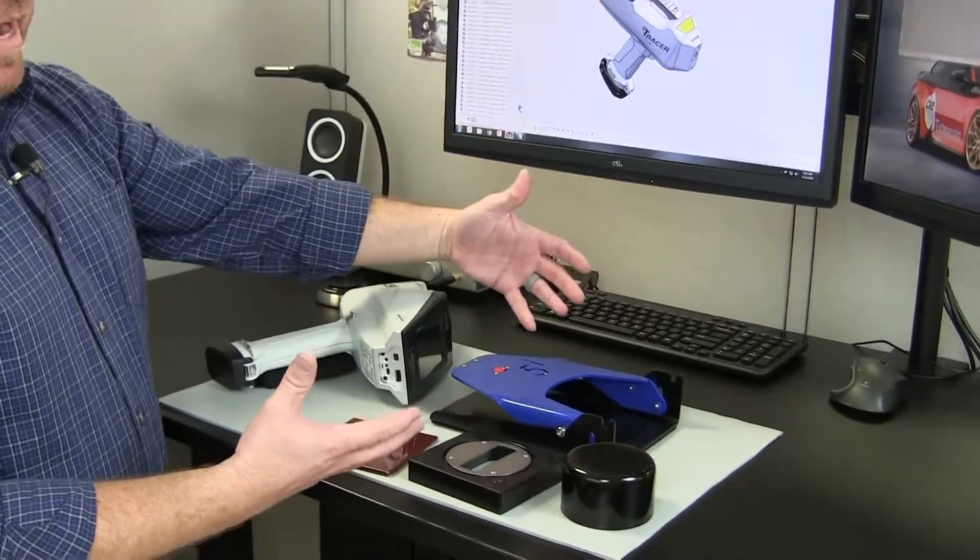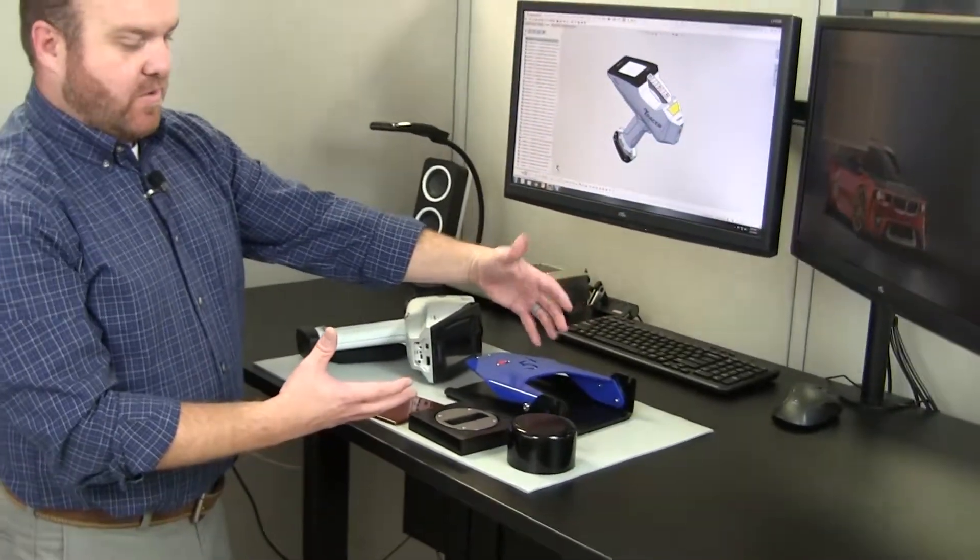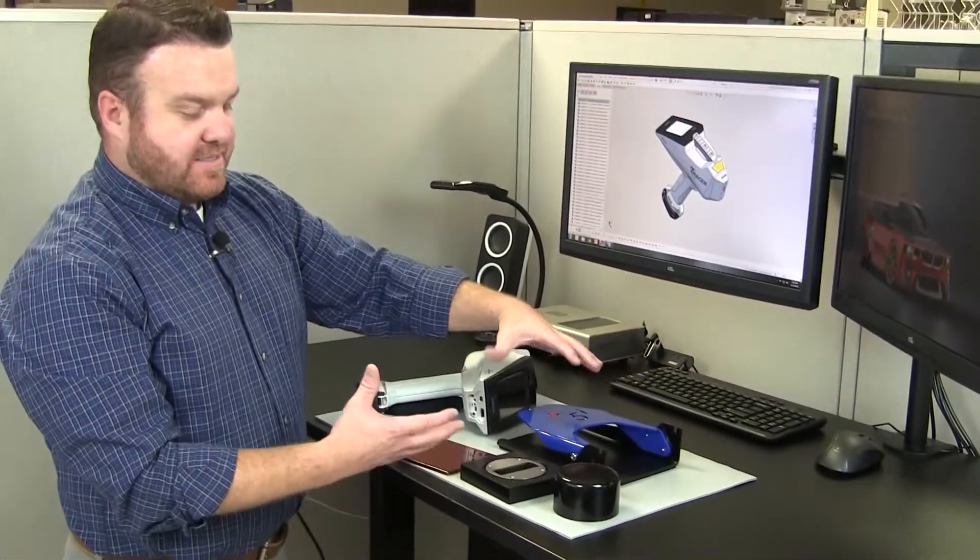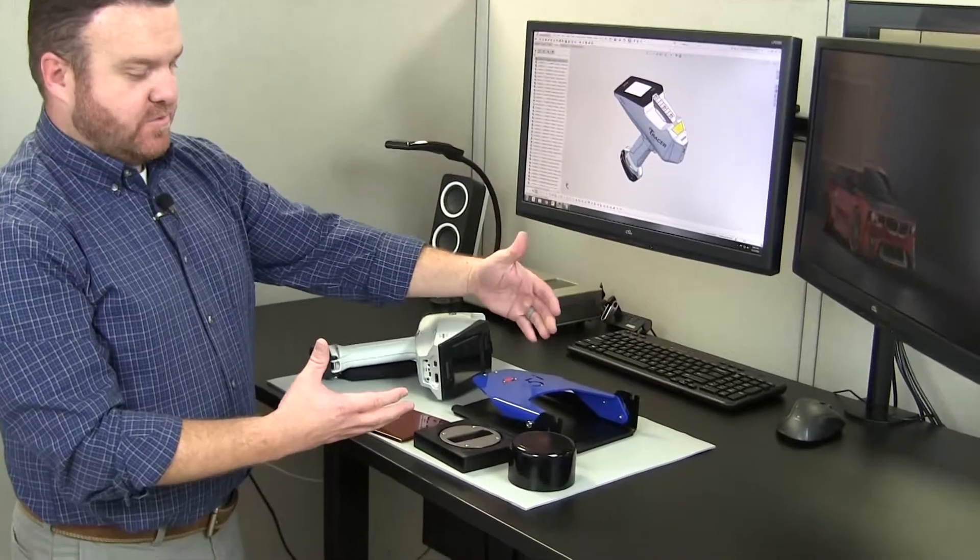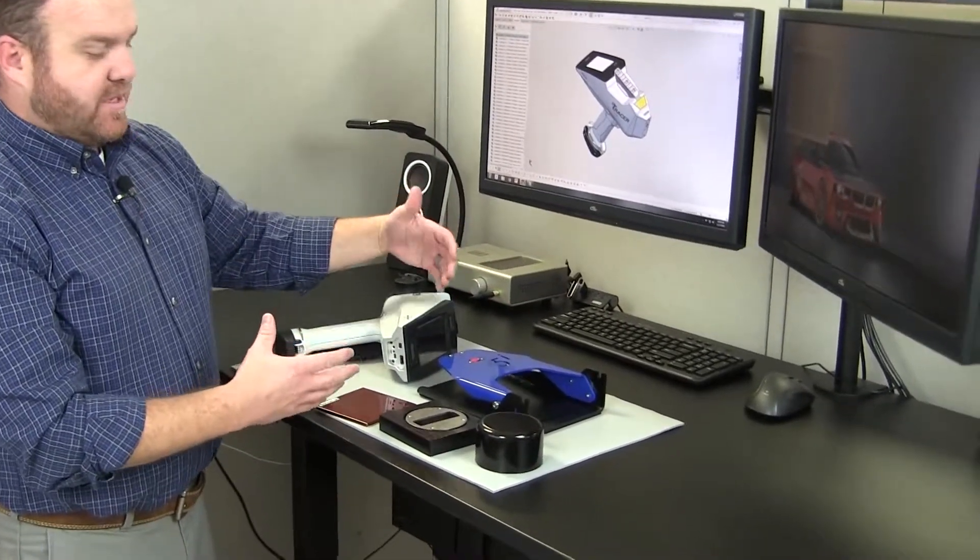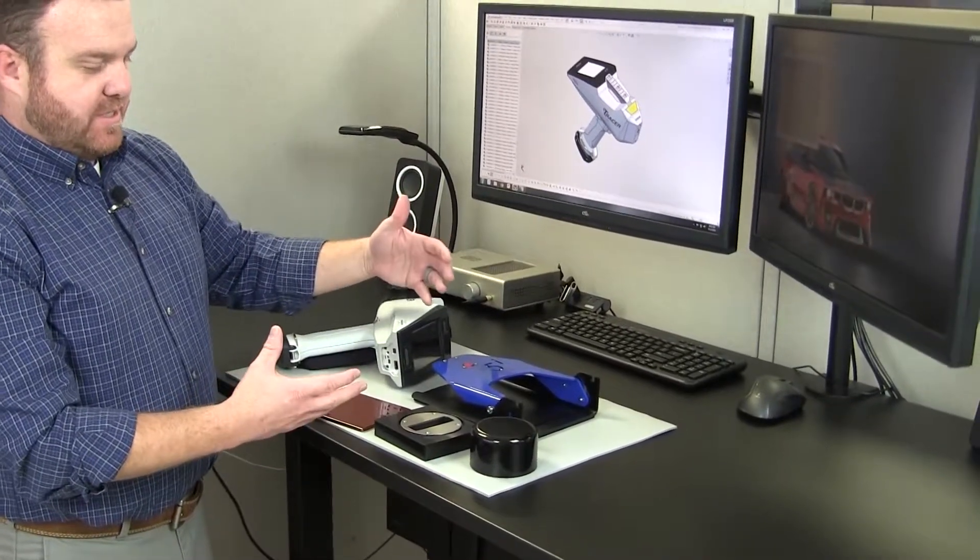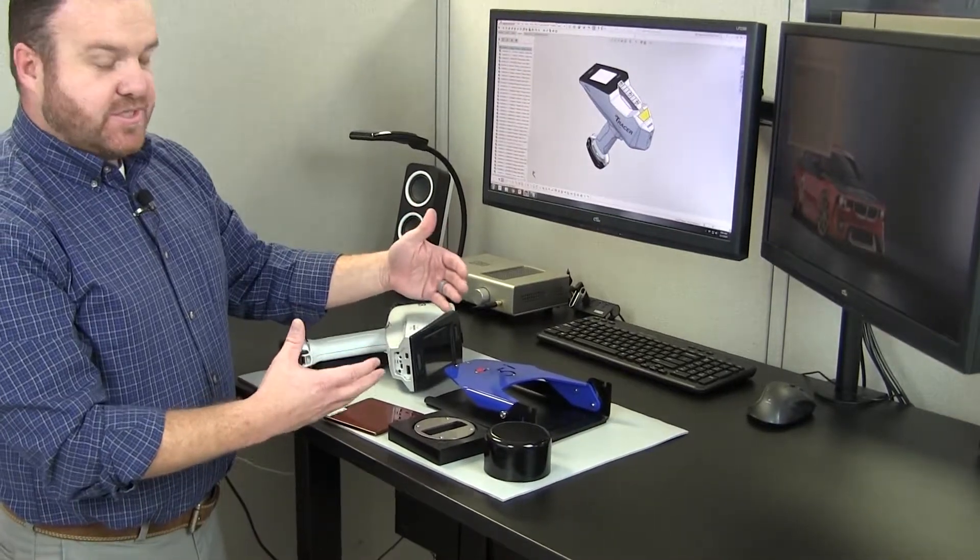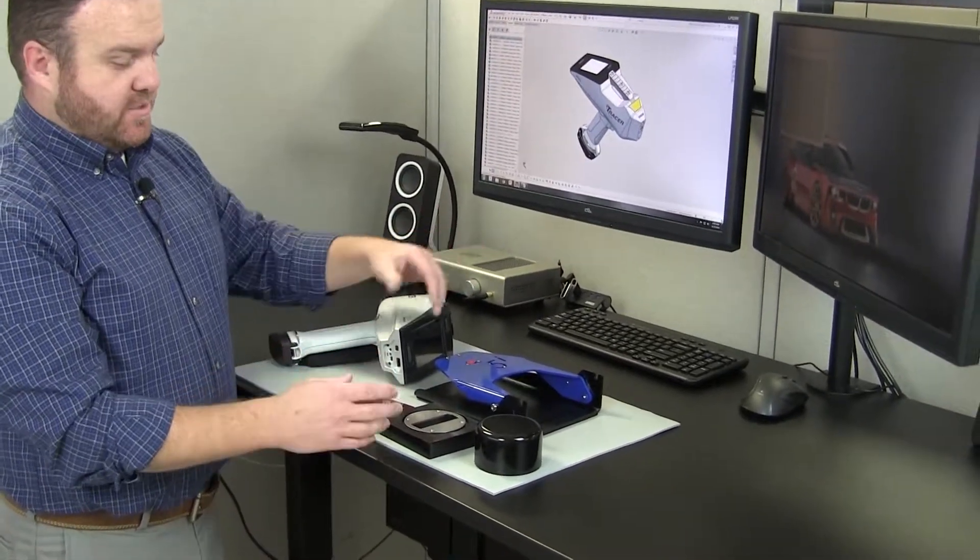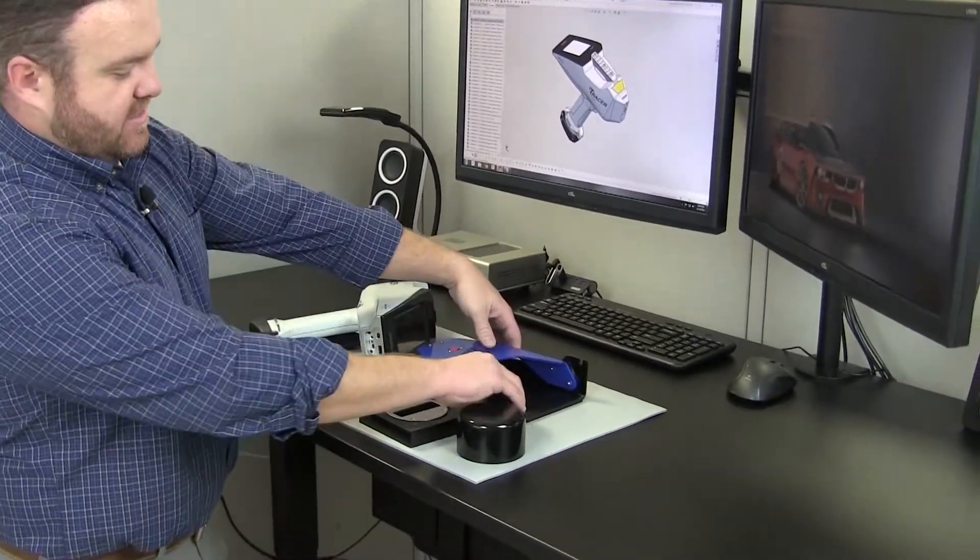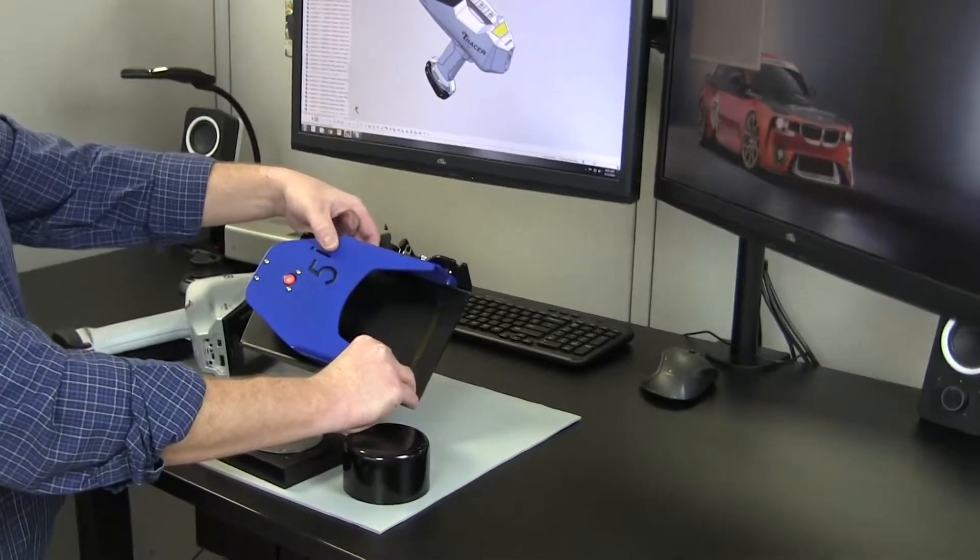It also has enough mass to allow the stand to not tip over and to hold the instrument, as well as be positioned so that it can be nose up or nose down. Here you can see it's in its folded down state.